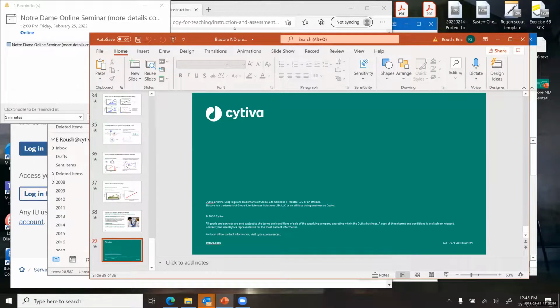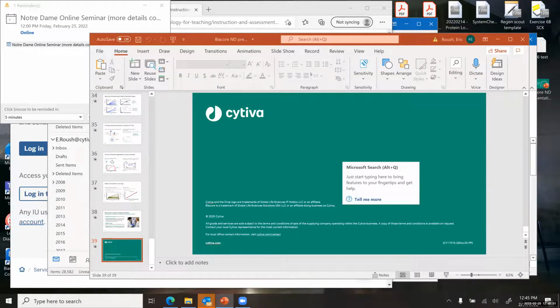All right, so we've had some things pop up in the chat. Let's take a look. Okay, are coated chips with the advantage of regeneration as durable as non-regenerated chips?